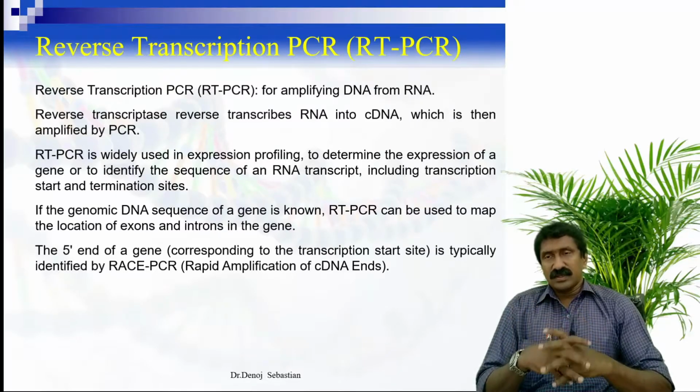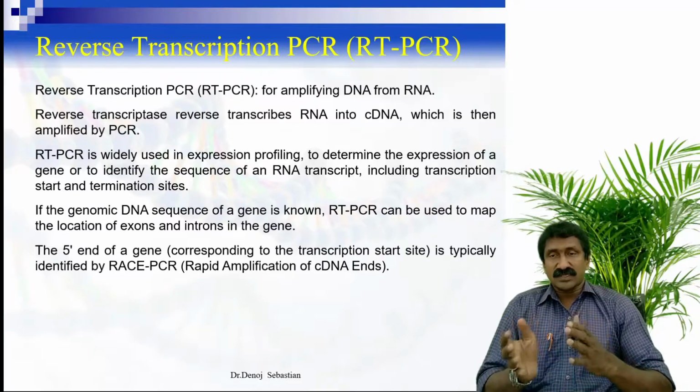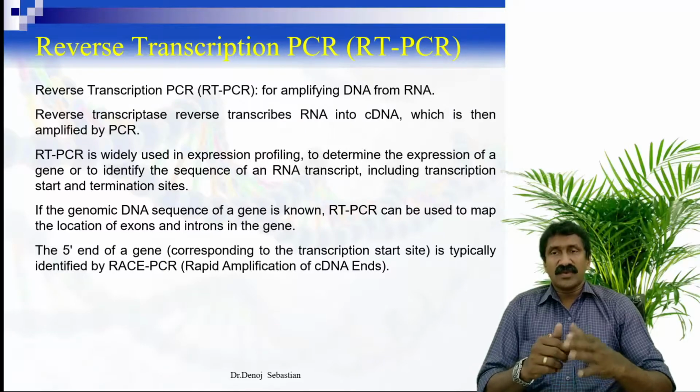The reverse transcriptase enzyme reverse transcribes the RNA into a cDNA, which is then amplified by the PCR.